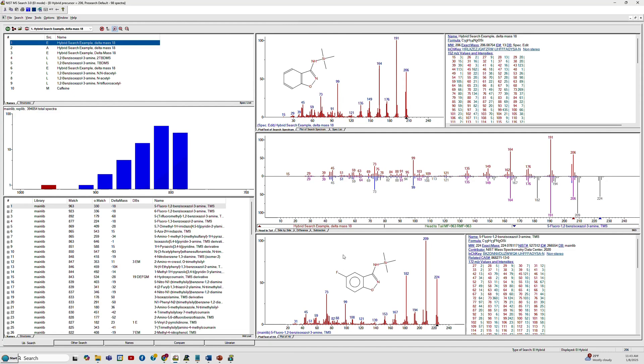The difference is in our unknown the fluorine has been replaced by hydrogen. This difference is of course 18. If you look at here in the table it shows these delta mass values, and the difference is 18.